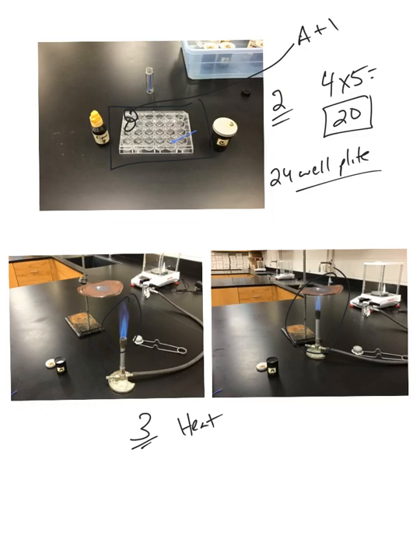One thing you want to make note of is the distance between the top of the Bunsen burner and the bottom of the lid. You want to keep that pretty constant, because the farther or closer you get, that might change the temperature which heats the powder. Along with seeing if the powder responds to heat, another thing you might want to write down is how quickly it responds. Does it respond immediately or does it take a while? How long? Those are all things you can put down. Again, the more detail you add, the easier it is going to be to identify it when you make a mixture of it.